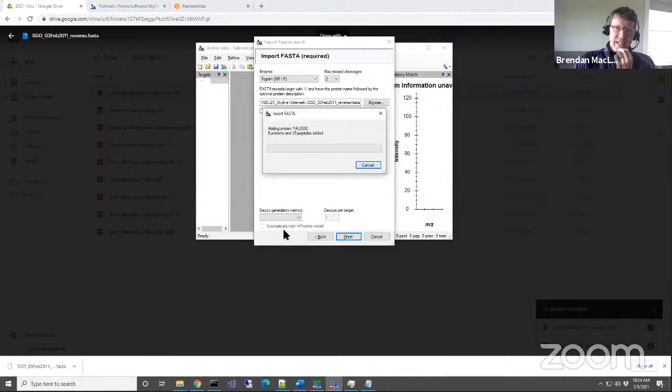Skyline's going to need to then digest all the proteins. I guess I should have had people start this even while we were waiting for the poll results, because it looks like it's going to take a little while. Not super long, and I don't know how fast everybody's computers are, so we could answer more questions at this point.